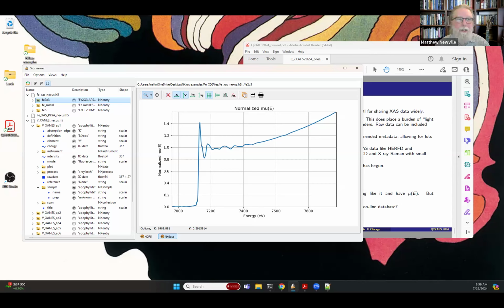I'm not sure. That's a great question. I think so. Okay, so I think to do a double edge, a fit of two edges simultaneously, and knowing that the sample is the same, you really need to have a lot of process knowledge, as we might say in DOE speak, that the sample was the same, and expressing that in a file that you expect someone else on a different continent 2 decades from now to be able to know is tough.